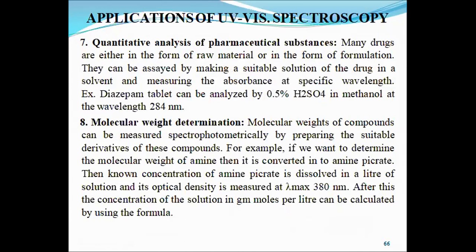There are many drugs which are either in the raw form or in the form of formulation. So if we want to assess any kind of drug which is undergoing the process of formulation, it can be easily analyzed. The last application is molecular weight determination. It is again an important application.